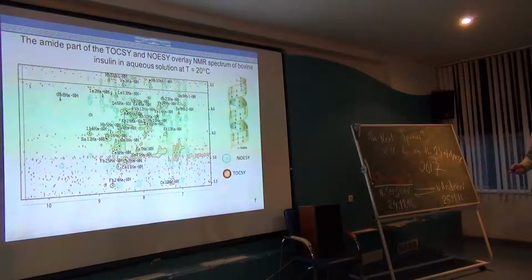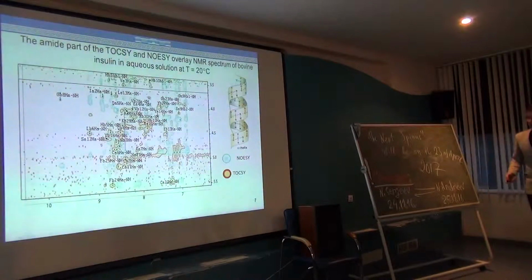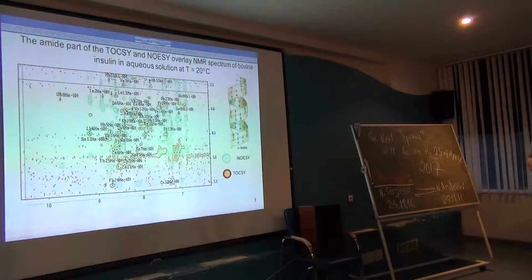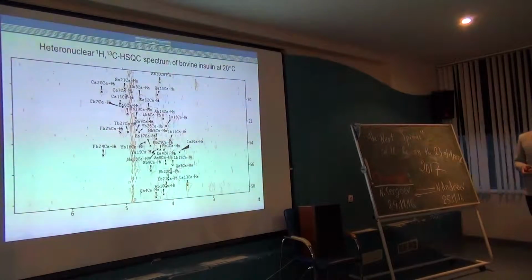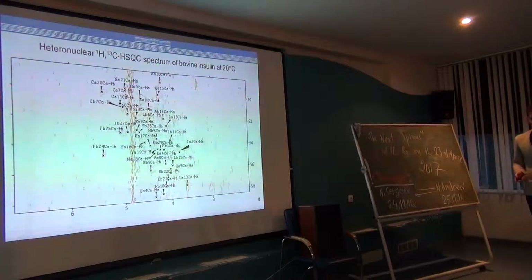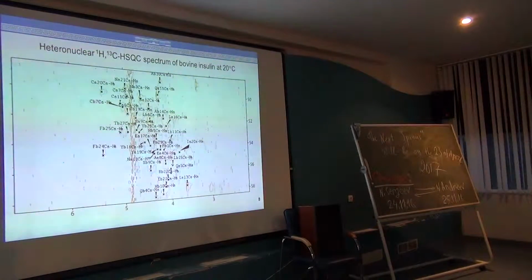So, for example, choose 5.5 ppm on the vertical axis. We can see four blue signals. It indicates that we see signals between residues, and we can predict a protein folding, such as alpha helix. Additionally, we recorded heteronuclear spectra, such as HSQC. HSQC yields correlation through directly bonded proton to heteronuclei, such as carbon. So using heteronuclear and homonuclear spectra, we completely accomplished the spectra assignment.